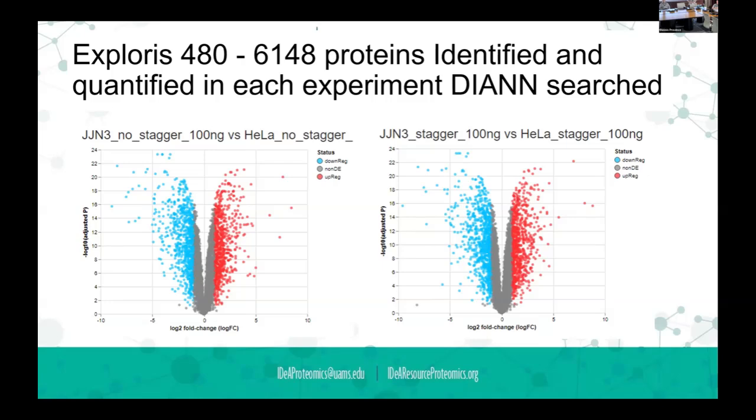How would we know that? I'm assuming you probably ran it with NA, so NAs are probably omitted from this, but if you click on the dots, the other plot is where it shows me that information. We can go through that tomorrow morning.